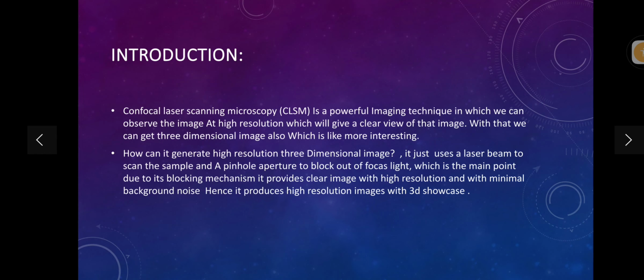And apart from this, it will give you a three-dimensional image also. The three-dimensional image will also help scientists to observe the tissues, structures, cells clearly, and get an idea.